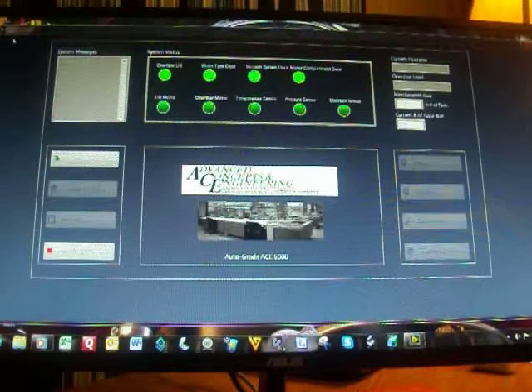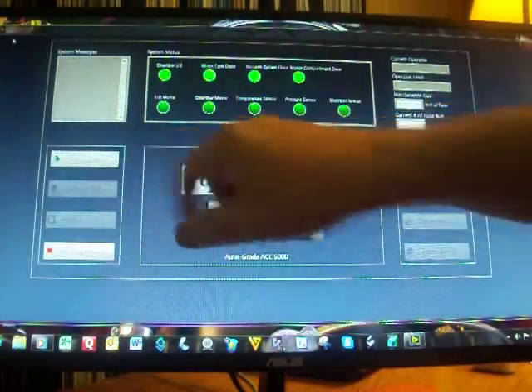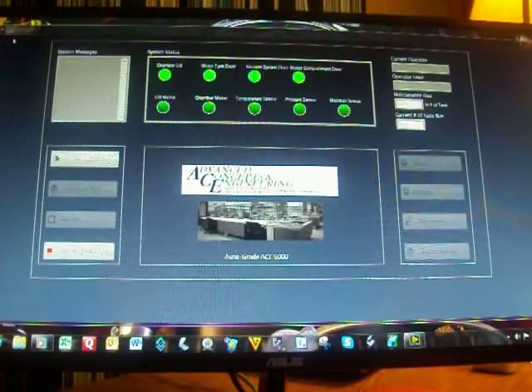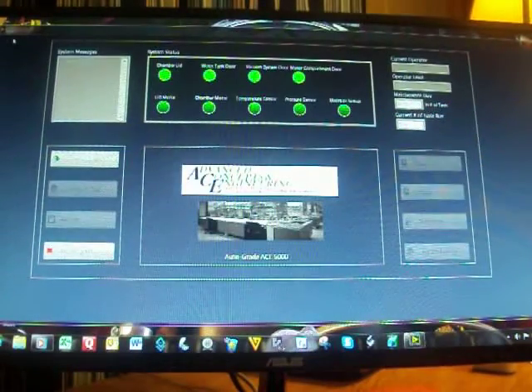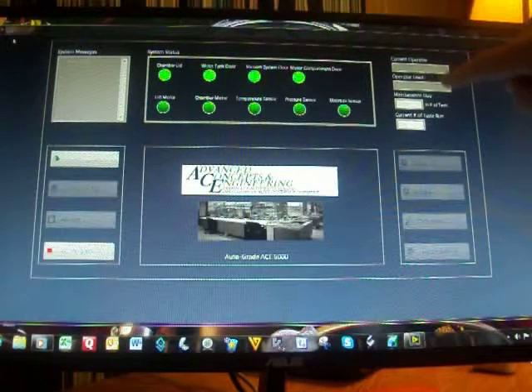Okay, once the system has started up and done its self-tests, the operator has two choices. He can quit the program or he can log in. Once an operator is logged in, say it's the end of his shift, he can hit this button again and log out and let somebody else log in. Whoever the current operator logged in is will show up here.